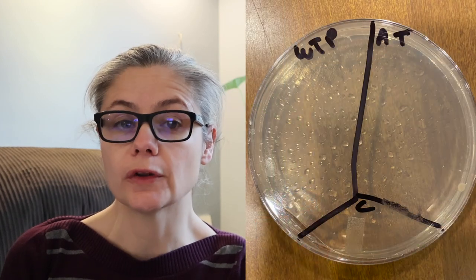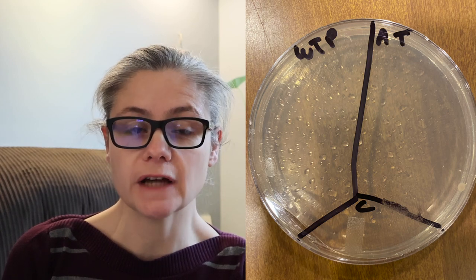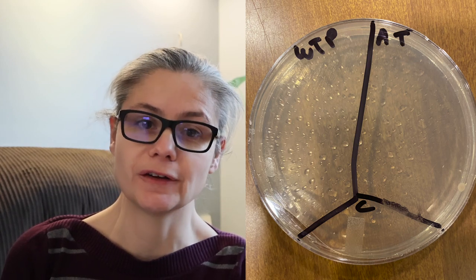Results for flushing with the toilet lid down for 1 week. So near the vanity, we have no bacteria growth, but near the mirror, we have one small bacterial colony. The wall with the toilet paper had no bacteria growing. The wall above the towel rack had one bacterial colony growing. And behind the toilet and the wall next to the toilet both had no bacteria growing. So 1 week of flushing with the lid down produced just two spots with only one bacterial colony growing.